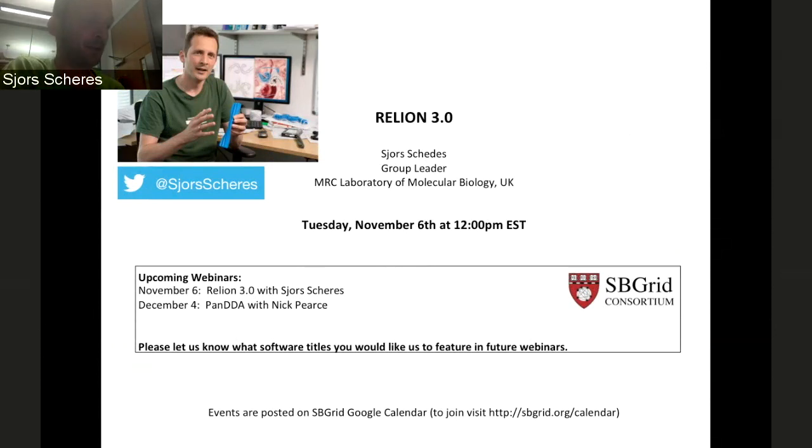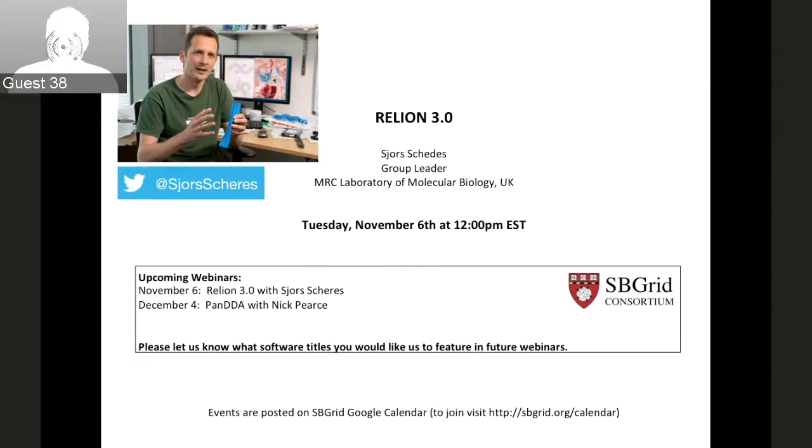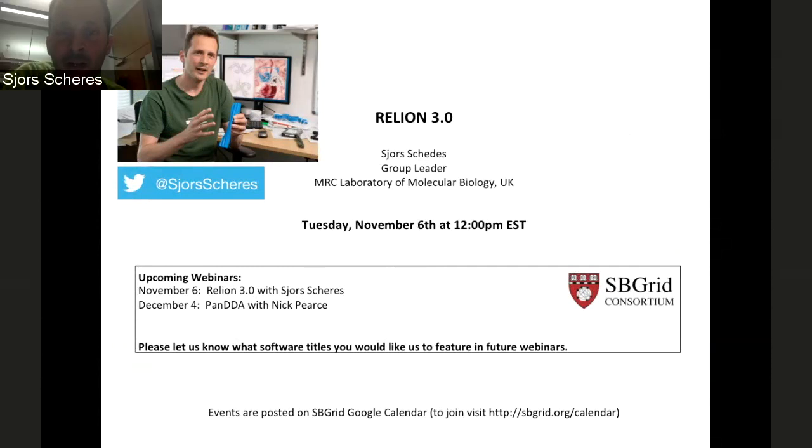So if you have a typical example of an icosahedral virus from which floppy domains are sticking out, then the floppiness of those domains probably does not obey icosahedral symmetry. And then rather than using multi-body refinement, you should use a program called Relion Particle Symmetry Expand. This procedure of symmetry expansion is described in a 2016 review in Methods in Enzymology, the book edited by Tony Crowther, which is all about classification of images in Relion.